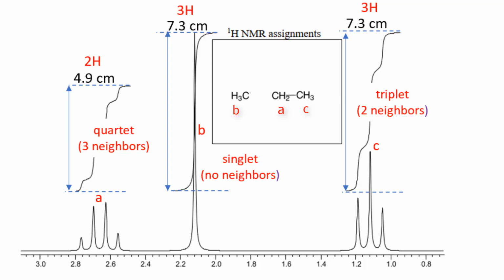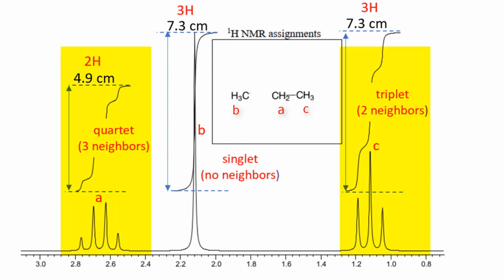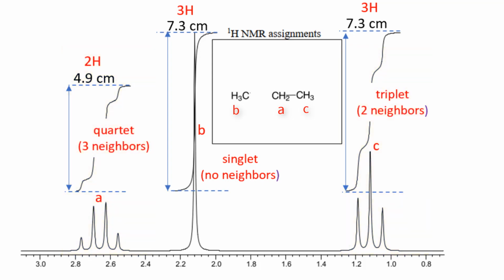As you go through and solve structures, you're going to learn to recognize certain patterns, and the ethyl pattern is one that's going to be very useful. A quartet that has relative area 2 and a triplet that has relative area 3. These 2 fragments have to be connected in some way, and we know from the IR spectrum that we have a ketone, so in the middle sits a carbonyl. Having the 2 fragments bound to a carbonyl also is consistent with the chemical shift values.